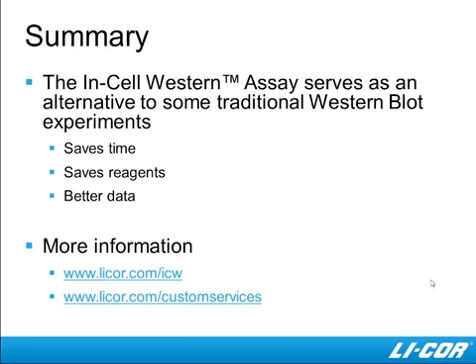Plate readers typically are in all the labs. The issue with trying to do this assay with a plate reader is plate readers only take a couple samples per well. An Odyssey system will scan the entire surface of the well. So if your well is not 100% confluent and you put that plate into a plate reader, if the plate reader tries to excite these fluorophores and it hits a spot where there are no cells, perhaps you're not at 100% confluency, maybe you're at 70% confluency, and in a given well, a plate reader might miss signal.